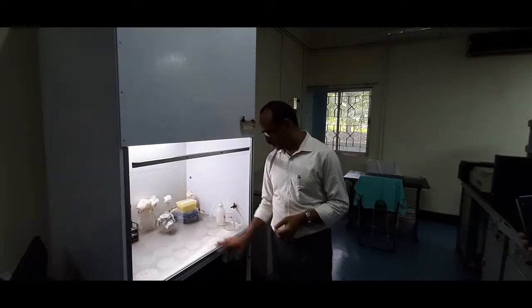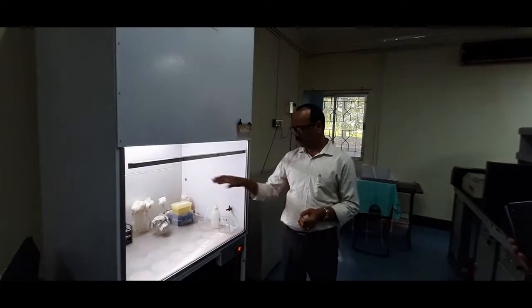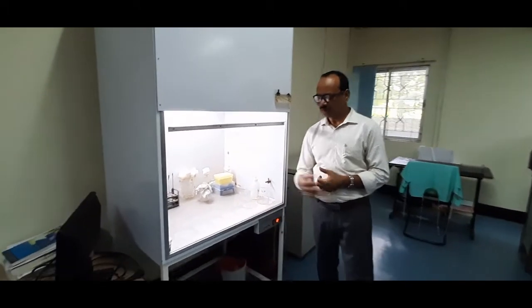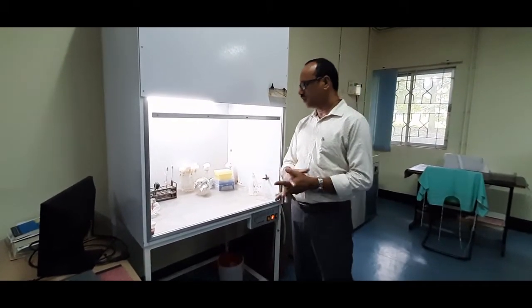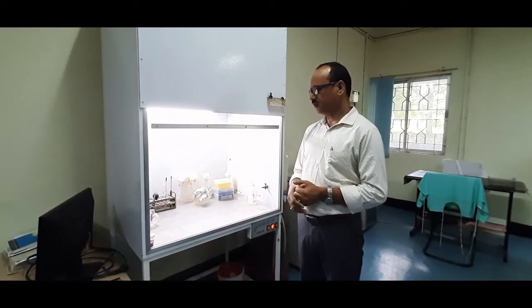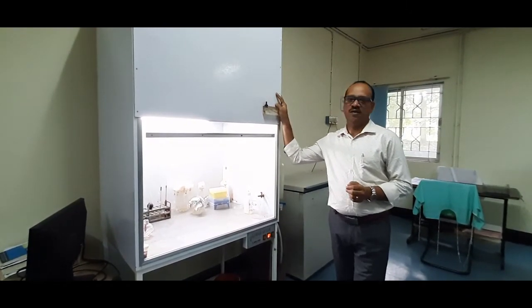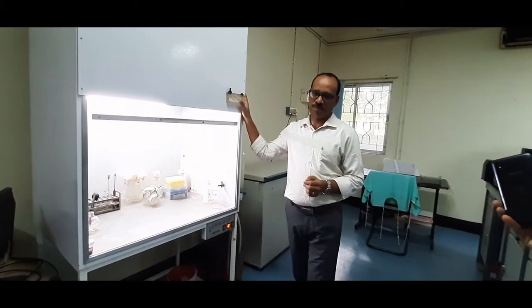The laminar flow hood has a UV disinfectant. Before starting work, you switch on the UV and allow it to stabilize, then switch on the airflow so your workspace is safe. After transferring samples and performing other procedures, they can be taken for further reactions. This is a mini laminar flow hood which you have in the molecular biology lab — it is a must for any molecular biology lab, because all work starts with microbes.